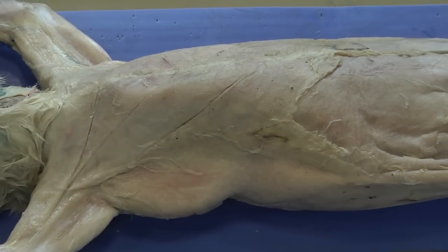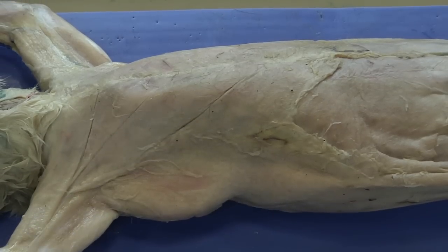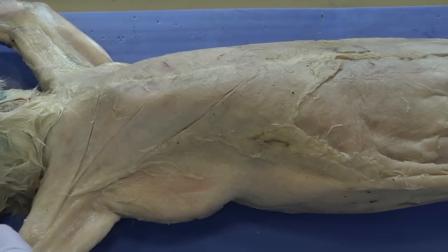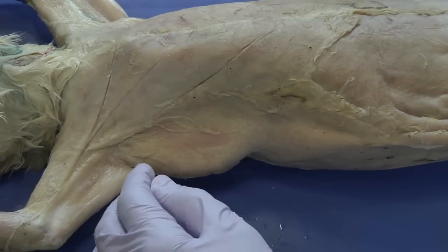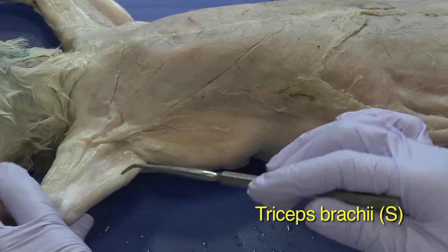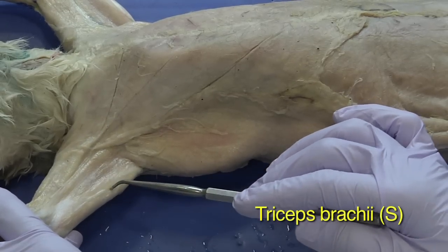Next, since we're already in the arms, I'll identify the biceps and the triceps. The triceps are visible just on the surface — this is one of the head groups of the triceps.